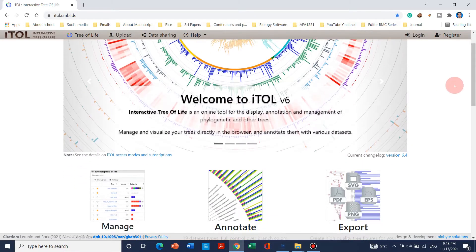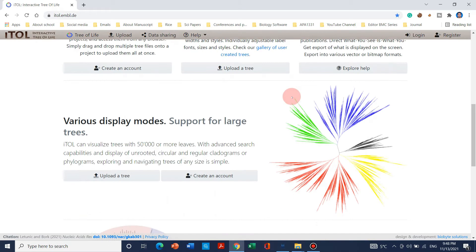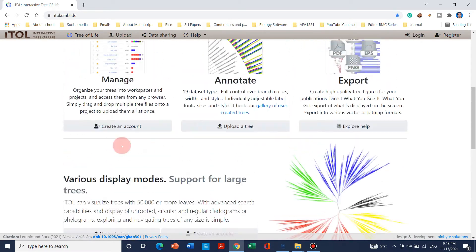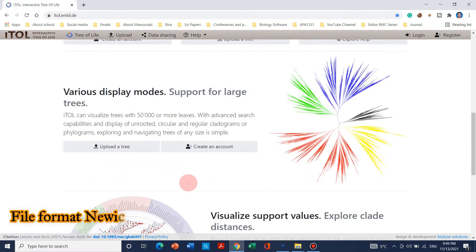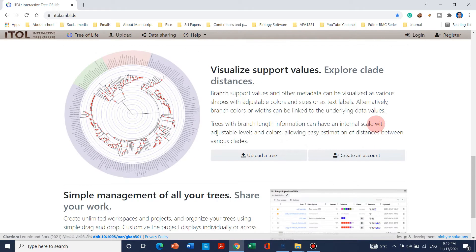Welcome to another video tutorial. In this video I will tell you how we can use a website called iTOL for creating beautiful phylogenetic analysis trees and sequence alignments. The actual problem with this website is that it takes only a specific format of file, so we need to upload that specific format for creating these beautiful figures. We can use our previous software for creation of that file format.